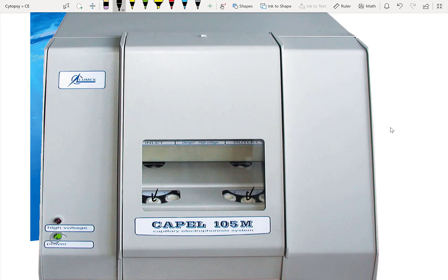We're now going to put our sample here, and we're going to put an outlet sample here. You can see inlet and outlet are labeled. Inside, there's a capillary that connects the inlet and the outlet, and there's an electric field that causes samples - remember, the electroosmotic force is moving samples from the inlet to the outlet. And there's actually an injector that's going to come in and pick up samples from our inlet and inject it into our capillary. This voltage should turn on once we've loaded all of our samples. And in this case, we're running normal polarity. Just remember that that means all the bulk liquid is flowing towards the cathode.